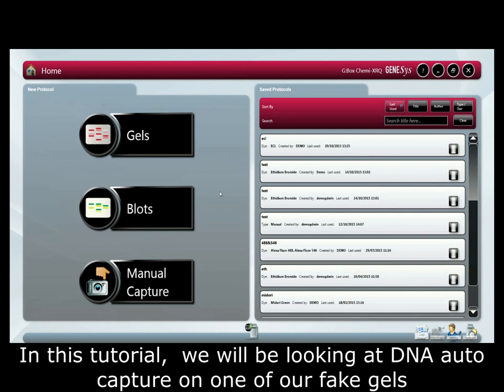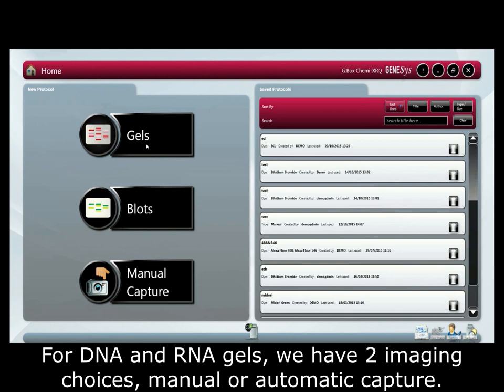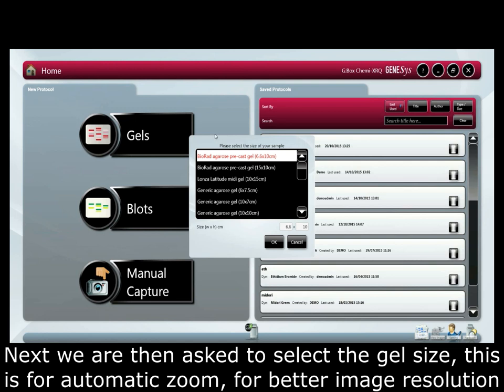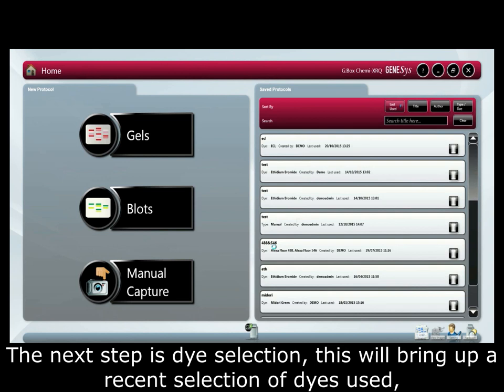In this tutorial we'll be looking at DNA auto capture on one of our example gels. For DNA or RNA gels we have two imaging choices: manual or automatic capture. In this example we'll do this automatically. We select gel and DNA agarose, then we are asked to select the gel size, which is used for automatic zoom for better image resolution.